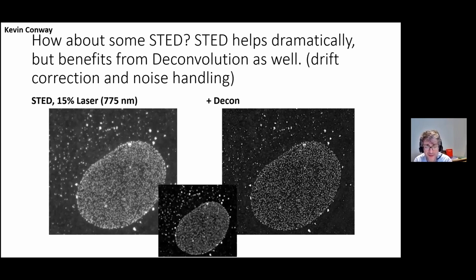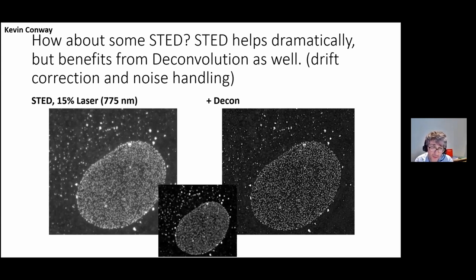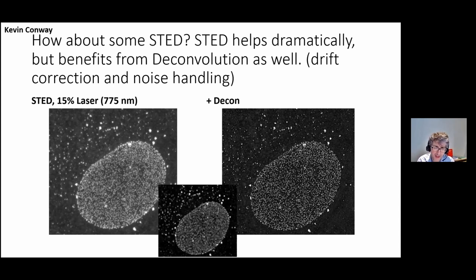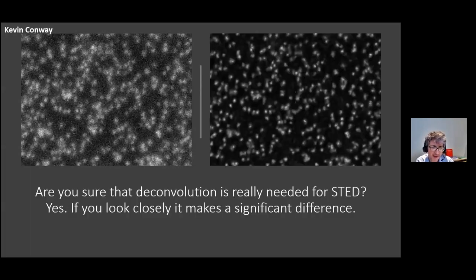With STED using a 775 nm depletion laser and Star Red, the image cleaned up remarkably. Deconvolution helps the STED image a lot — dealing with the noise, since you have very few photons when doing STED. The STED laser depletes most photons, and gating removes even more. Drift can also become an issue during a long Z-stack — you can see that if you examine point spreads, they may drift slightly. But zooming in tightly, it does make a profound difference.